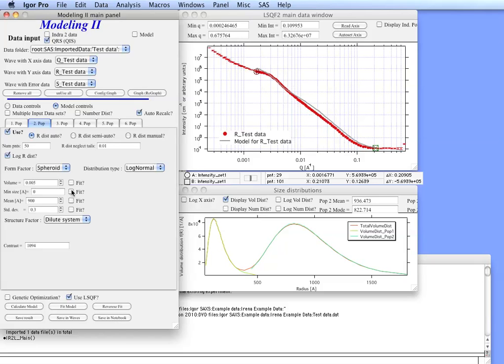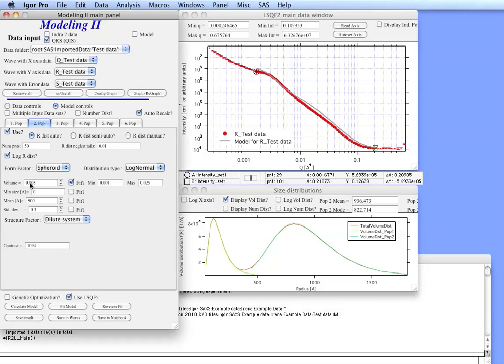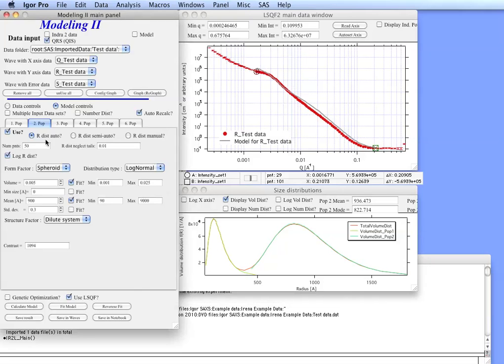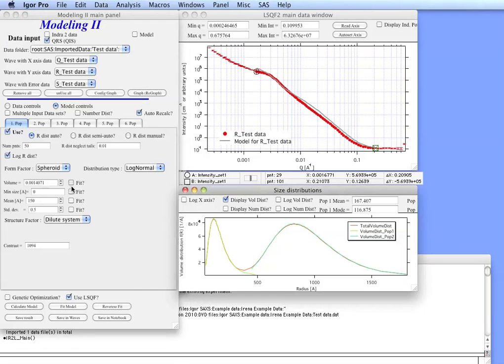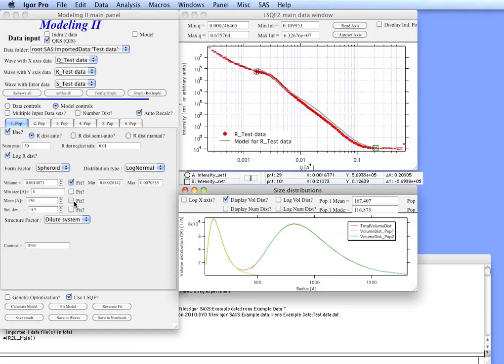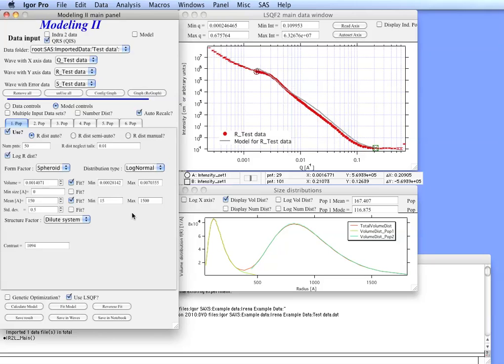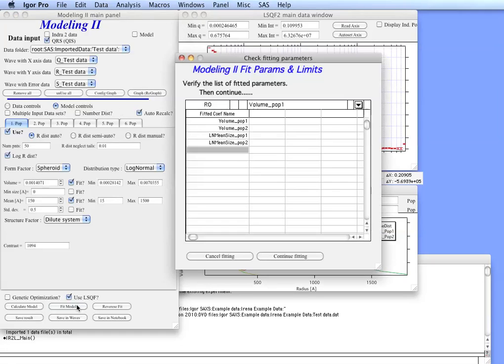With this what we can do is we can actually select the volume for this population to mean. We can go in population 1 and select volume and mean value too. For least square fitting we don't want to select too many parameters. We want to select the ones which influence the positions first most.